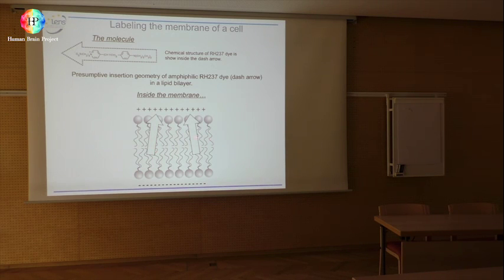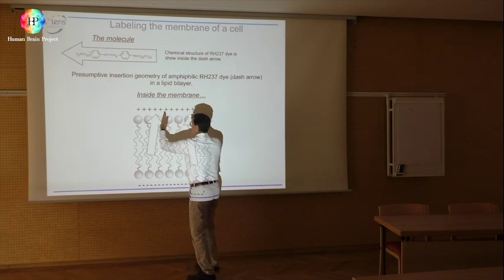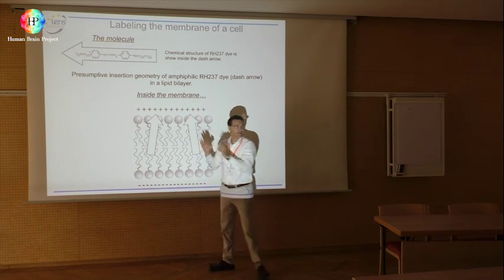So, if those 2 molecules are emitting second harmonic, if they are absolutely aligned, okay, the 2 signals are exactly the same and you have constructive interference. If they are upside down, the 2 are sine and cosine, and they have destructive interference. So the amount of interference depends on how those 2 molecules are oriented. Maximum interference, minimum interference, intermediate interference.